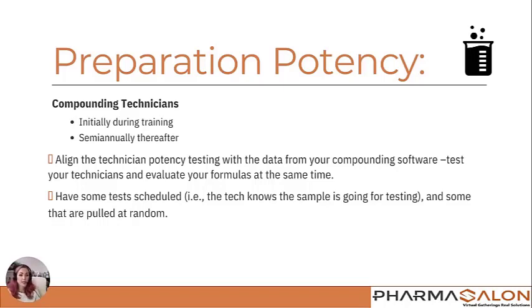Preparation potency testing is incredibly important for your compounding technicians. This needs to happen initially during their training. So they get hired on, they start their training, they do some competency assessments. Once that training and those competency assessments are done, they have an observation where they're being watched by someone who is skilled and qualified to make sure that they're following their process. Send that preparation out for potency testing.